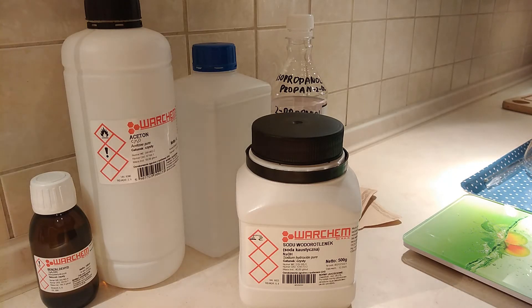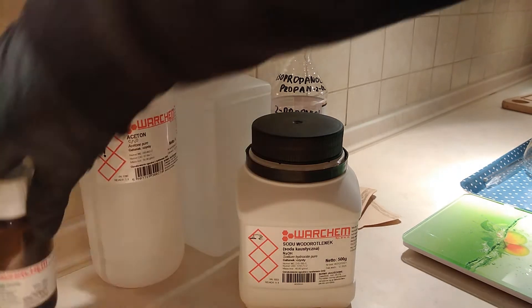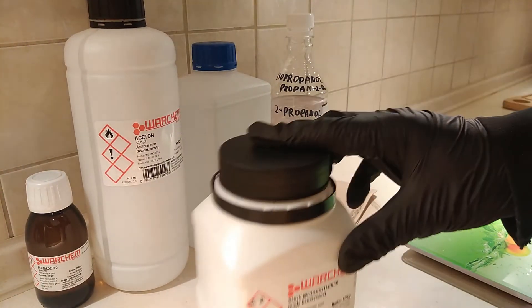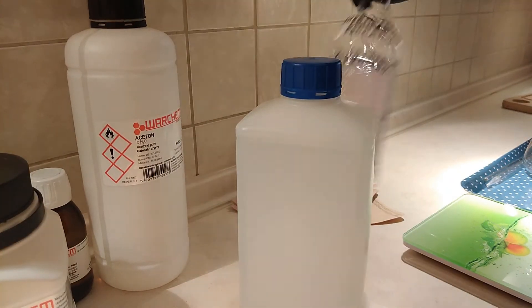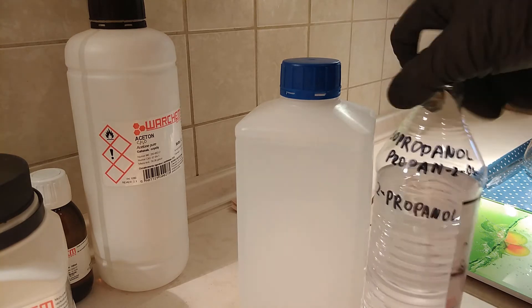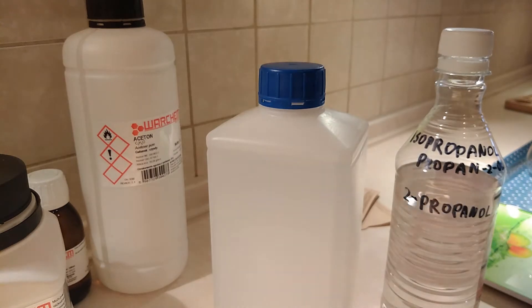Hello everyone. In this video I'm going to try repeating the synthesis of dibenzalacetone. For this synthesis we're going to need benzaldehyde, acetone, sodium hydroxide — those are the reagents — while the solvents and the reaction medium are going to be isopropanol, aka isopropyl alcohol, and distilled water. Let's get right into the synthesis.